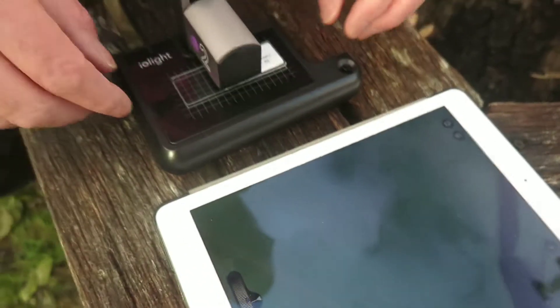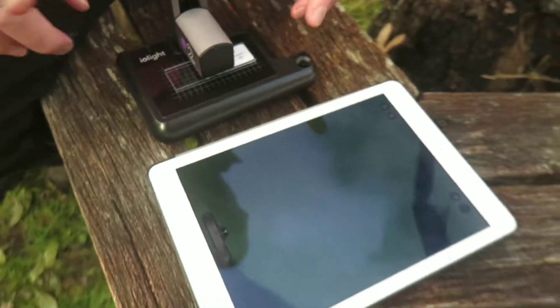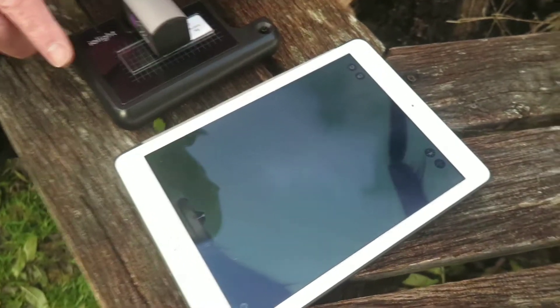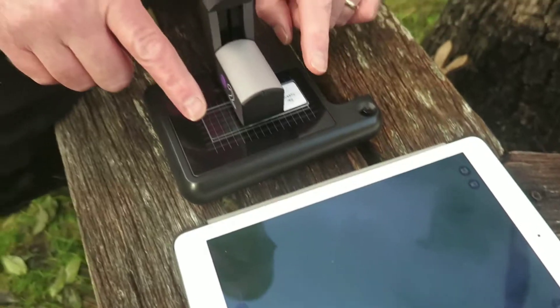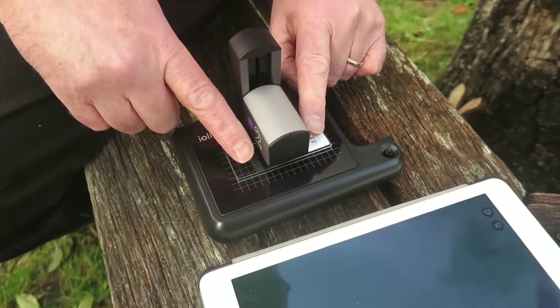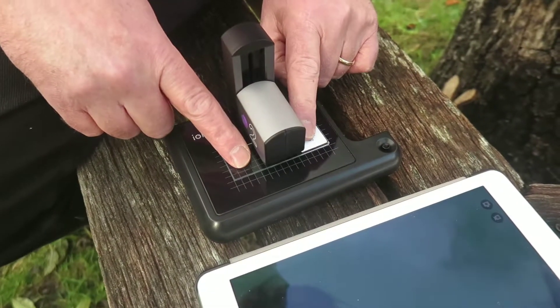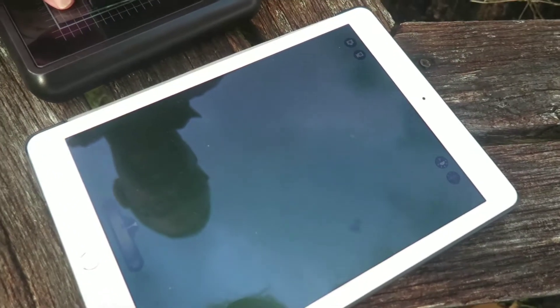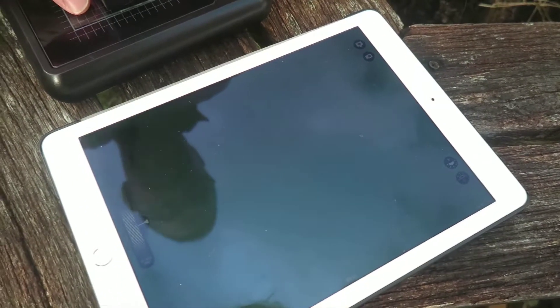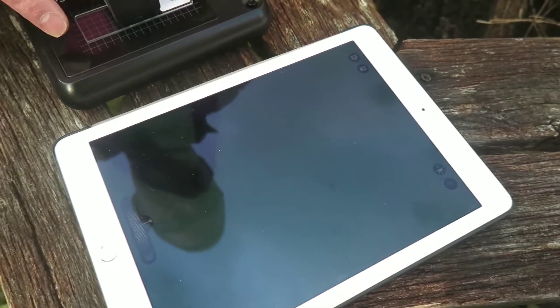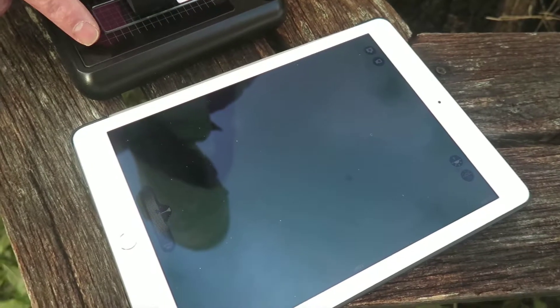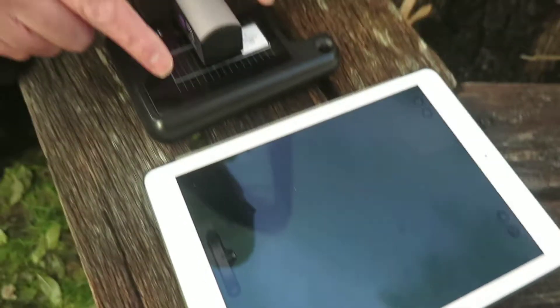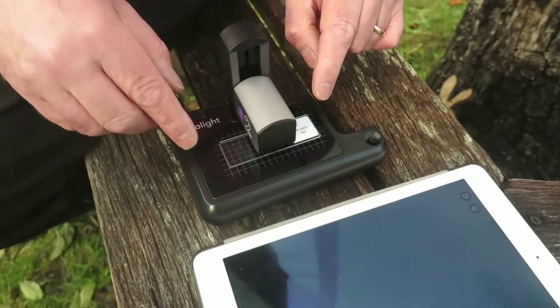So now we're going to find the correct bit of the slide that we need. So the problem here is if I put my fingers on the slide like this it's zooming around all over the place and I'm not going to be able to get a good image because the slide's made of glass and the stage is made of glass and it's too slippy.